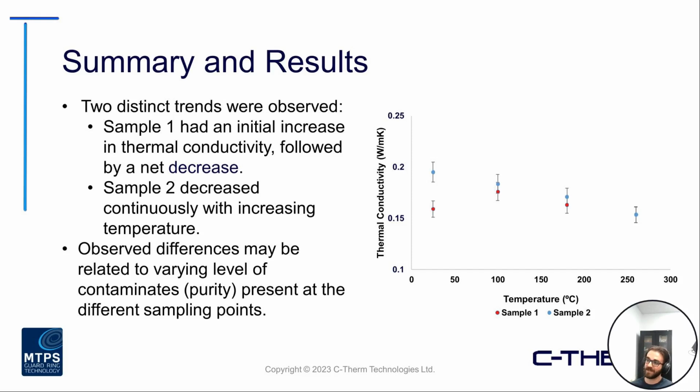By understanding how these different impurities can affect the thermal performance at these different temperatures, it can give you some information on perhaps optimizing the overall refinement process, the steps that are done along the line, where is the best point to introduce these specific refinement steps, things like this, especially if you're dealing with something as a function of temperature. And a lot of the time, temperature is a significant component to what's occurring in these systems.